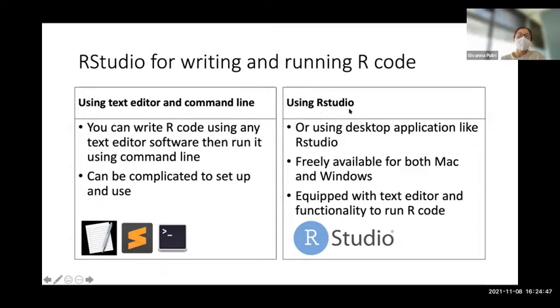That's why a lot of our tutorials for today and subsequent days will be using RStudio. It's freely available on both Mac and Windows. And within RStudio, you have the text editor and a few functionalities to run code, view the output, and so on and so forth.